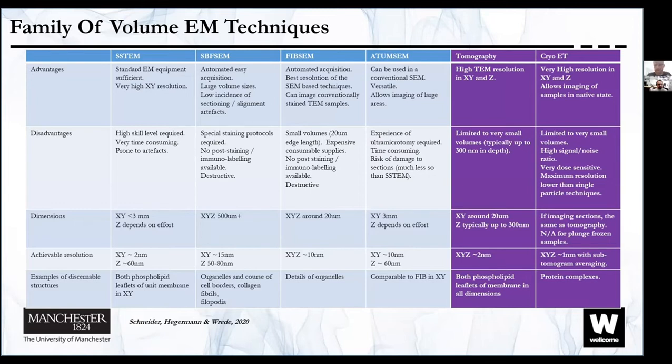Cryo-electron tomography has its own problems because in conventional electron microscopy, the heavy metal stain negates a lot of the problems you might get with charging, whereas carbon is very prone to being absolutely ravaged by high energy electron beams, and as a result, you're limited to small doses. The signal to noise can be very poor. But ultimately, it allows you to render really small stuff and can be super good.